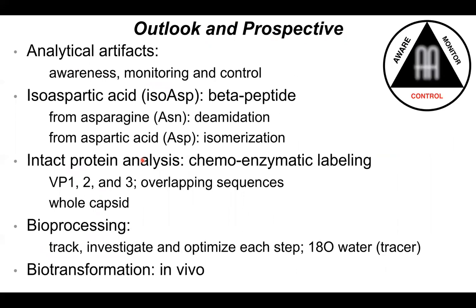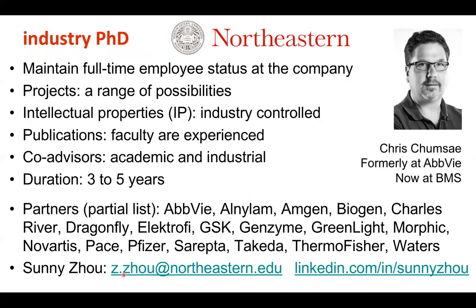So with that, I just want to very quickly summarize my talk. My talk really focused on the analytical artifact. I talked about some work people have not had time to work on: isoaspartic acid, intact protein and capsid analysis, bioprocessing, how to monitor each step, and how to investigate biotransformation in vivo, maybe with a more pertinent model system.